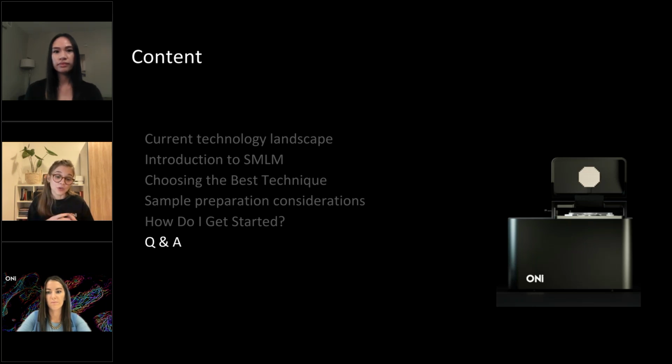With the base pairing, you can play a lot, and depending on, for example, parameters such as binding kinetics, you can have different pairings. You will not see different colors, but different DNA pairings. And this flexibility and still this specificity of DNA allows you to have more than 3 colors if you wish. I think in localization microscopy, it's the standard for more than 3 to use a DNA-PAINT kind of approach.